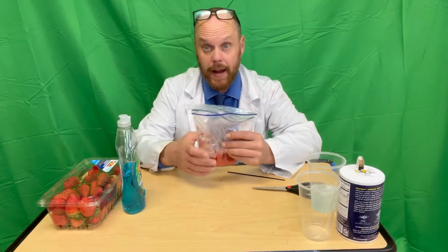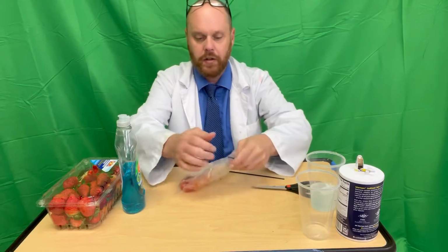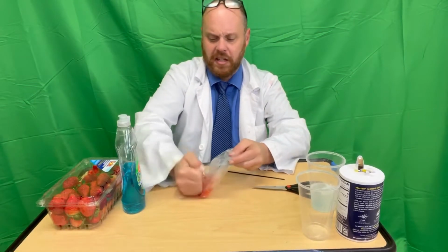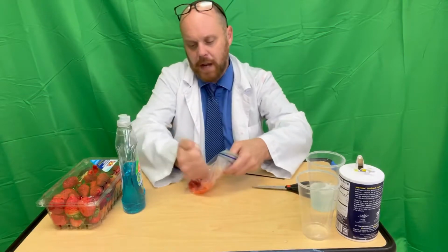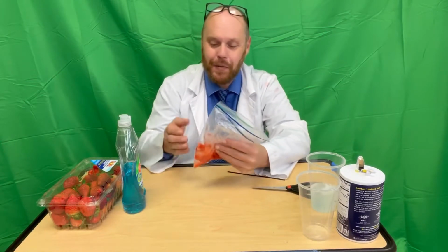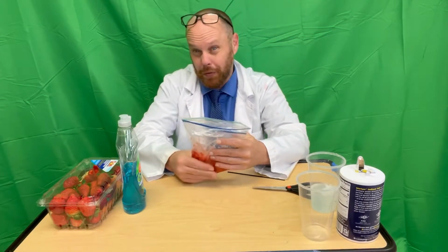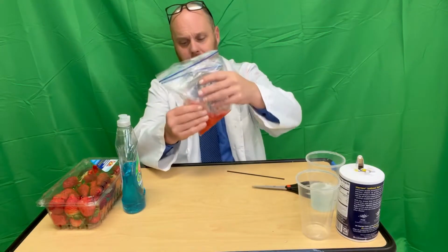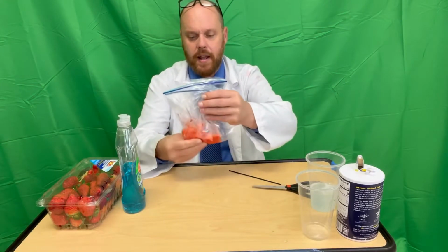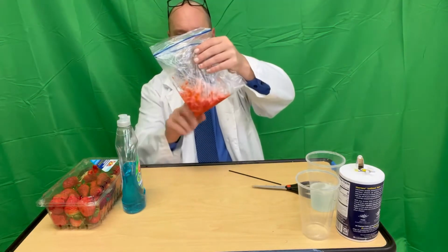Now that we have the strawberry and the solution mixed together, I put it in another bag so it would not pop on me again. We're going to resume with the smashing. Now, the big thing is to make sure that we are not getting all those soap bubbles. So you don't want to smash it so hard that it pops the bag again all over Mr. Sargent. But you also want to make sure that you're mixing it the best you can without creating the soap bubbles, okay? So that's pretty good. I'll smash a little bit more. All right, so I think we got a good mixture of strawberry and a good mixture of the solution.